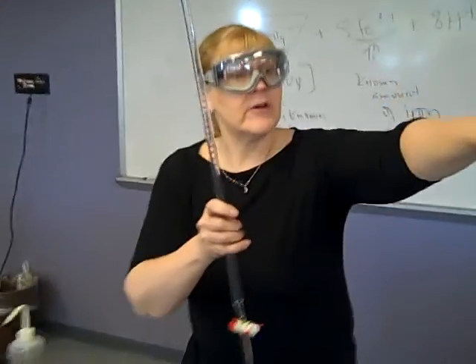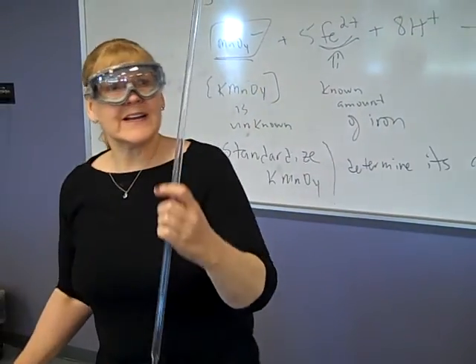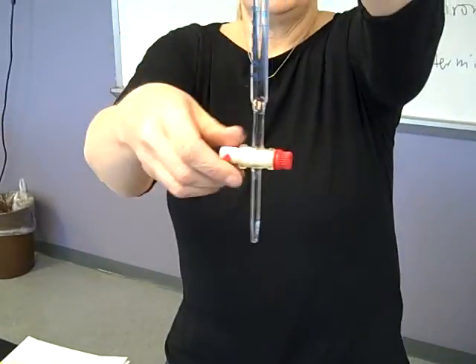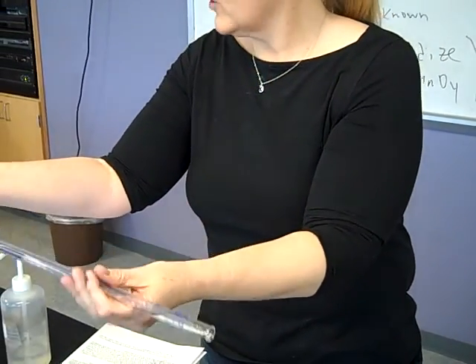You will get yourself a burette. They're in the drawers underneath the big beakers. You're going to clean it. To clean your burette, you are going to rinse it three times with deionized water. To rinse it, you fill some in, and then you let it drain out the bottom. Close off the drain, lay it on its side, and roll.